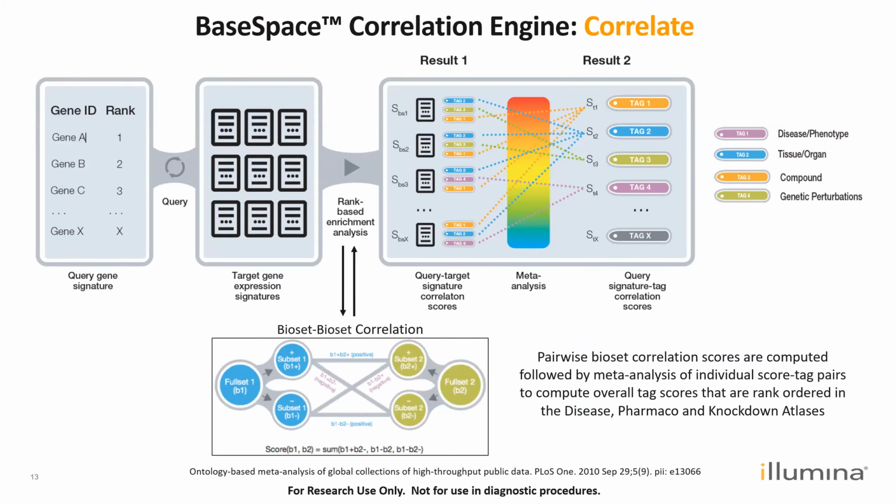This schematic depicts the correlation process. You can consider Correlation Engine in many senses an advanced search engine or adaptive learning machine. You can search by a gene, disease, compound, study ID, or as shown here, a ranked list of genes. For RNA expression, we use absolute fold change values. The gene with the highest absolute fold change is given a top rank of 1. For genome-wide association studies, the lowest p-value is given a rank of 1.